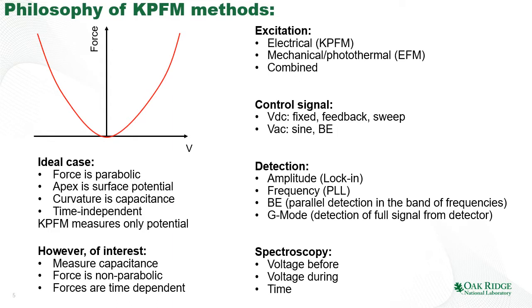To address these issues, so measure capacitance, measure forces which are not parabolic, and measure the forces that are time dependent, multiple research groups all over the world have developed a whole slew of KPFM methods. And they can be classified in terms of the excitation, control signal, detection, and the spectroscopy modes.